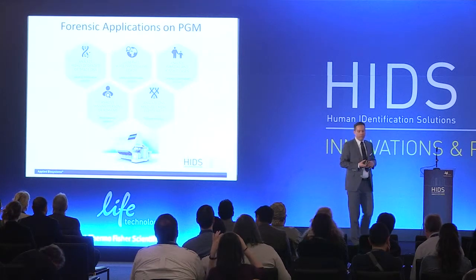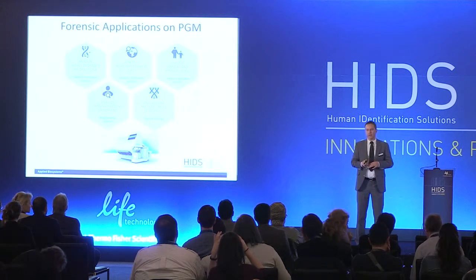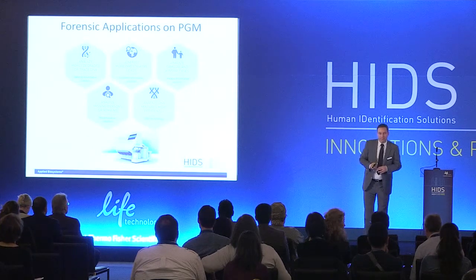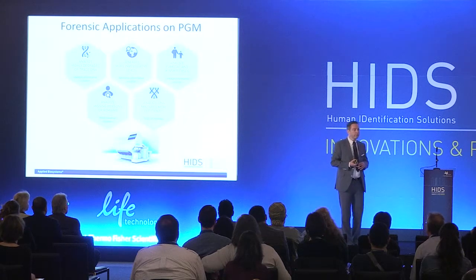Analyze complex familial and kinship cases. Again, here we can use SNP panels, you can use Y-SNPs, you can use Y-STR information to analyze these kinds of cases.